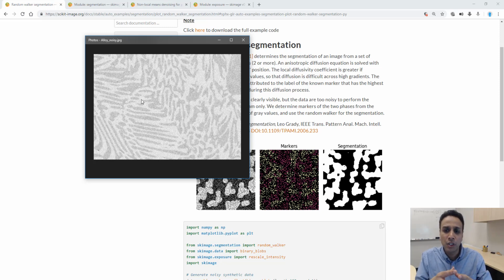Given that there is not much contrast difference between the two, the user either wanted to collect it this way, or maybe the difference in density between these two regions is not that high, so it's not covering the entire histogram space of, let's say, 0 to 255.